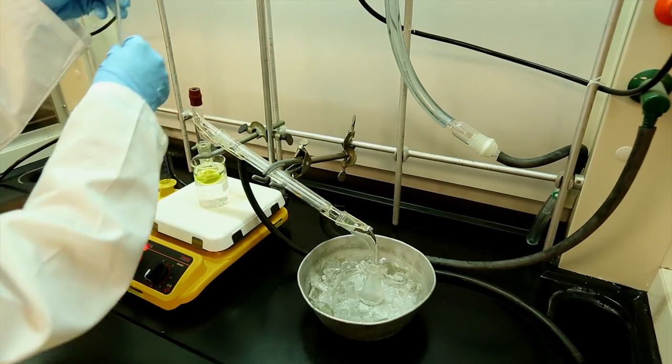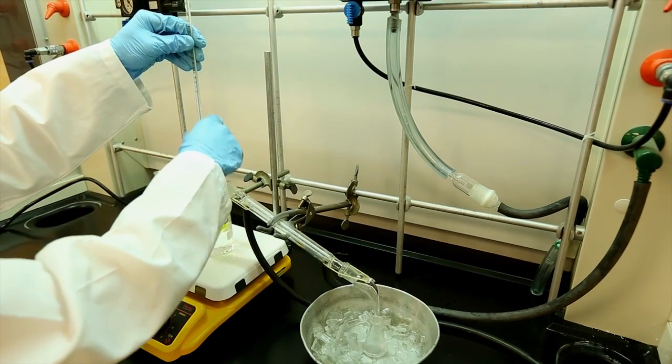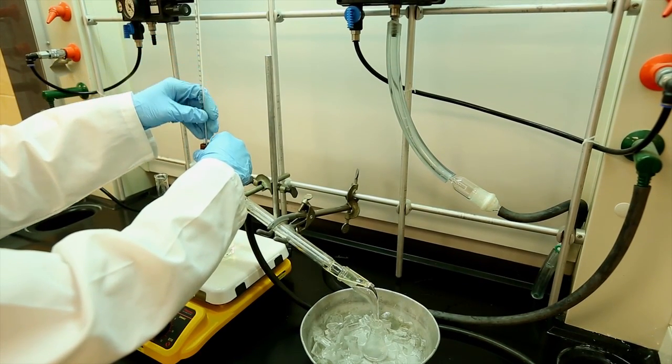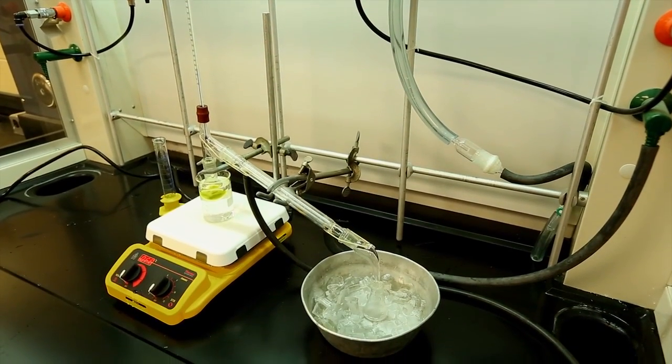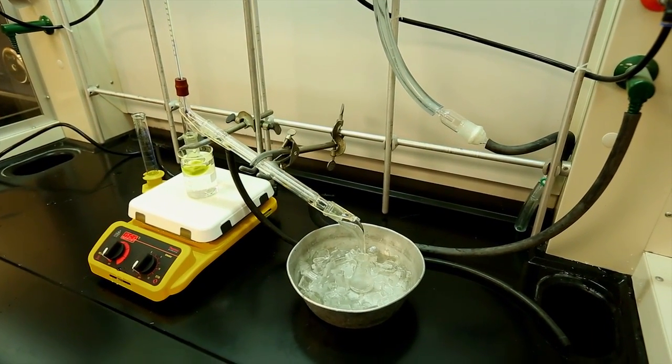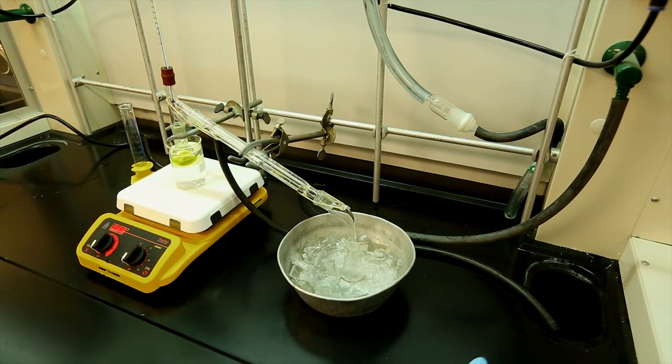Choose a receiving vessel that minimizes evaporation such as an Erlenmeyer flask which has a small opening. This is crucial when the distillate is the desired product. Also, the receiving flask should rest in an ice bath where the water reaches a level of the flask corresponding to the volume of distillate.